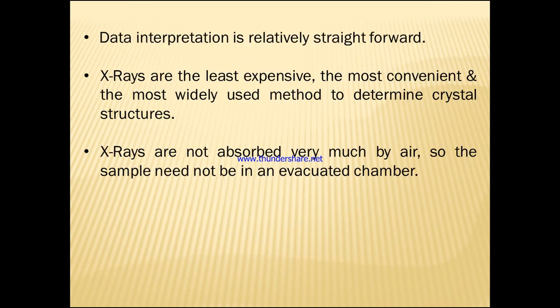In the same way, data interpretation is relatively straightforward. X-rays are the least expensive, the most convenient and the most widely used method to determine crystal structures. When we talk about crystalline materials, we can have crystalline as well as amorphous, but for both we can determine the crystal structure by using X-rays.